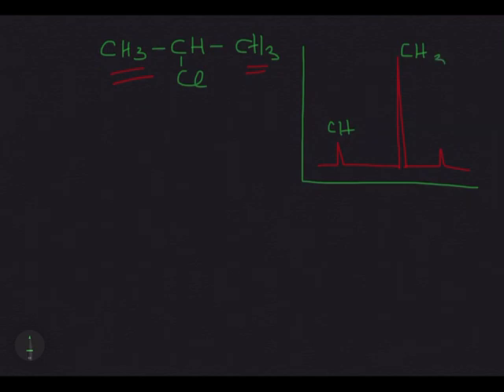CH3, TMS. This is the simple NMR spectrum of the compound.